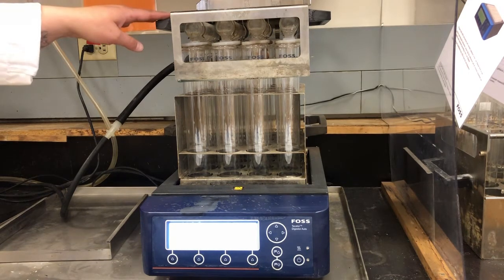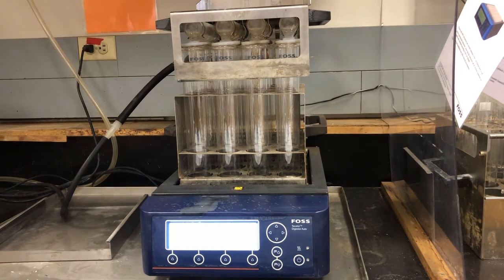On top of that, you'll notice this piece of apparatus, that's called a scrubber. What that does is it takes care of any of the harmful fumes or vapors that are being given off when it starts to heat up. So remember, we put concentrated sulfuric acid in these tubes. When the sulfuric acid heats up, it's going to give off a lot of vapors, and we don't want to be breathing that in. So the scrubber takes care of those vapors and neutralizes them before it releases it into the fume hood.